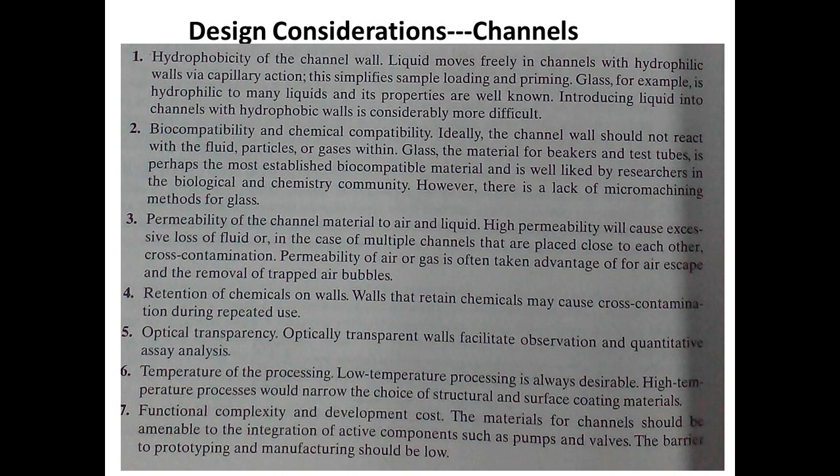Another factor you have to consider is the permeability of the material to air and liquid. Does it have a high permeability or not? If it has high permeability, the possibility of losing the fluid is much higher.